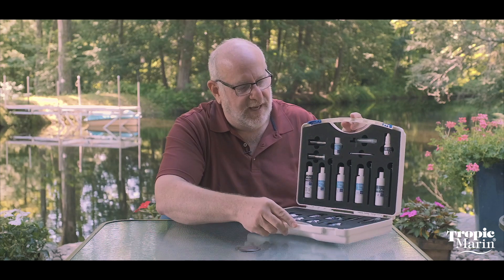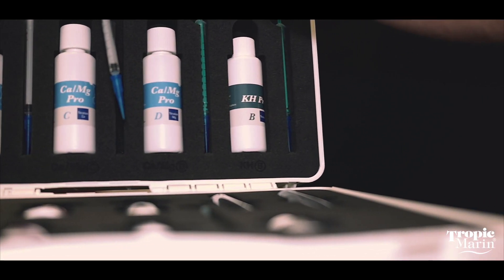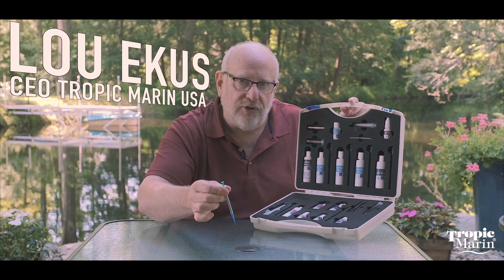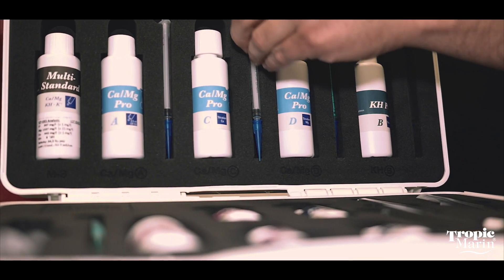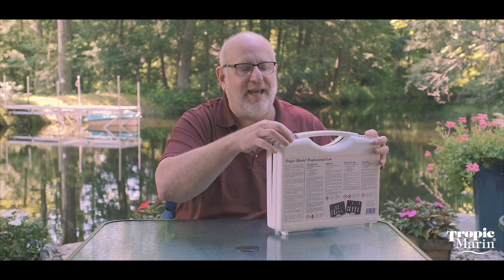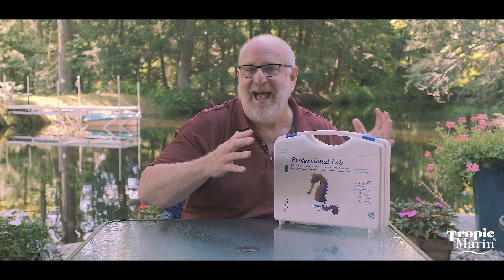Now it all comes in this organized case. One thing that I love about what we did was that the syringes come with the tips on each individual syringe that you're using with the different reagents. When you're done using it and you've returned the reagent to the bottle, this syringe goes back in its place with the tip on it and the whole carrying case stays organized. So you've always got a place to keep everything in your kits, which I absolutely love.